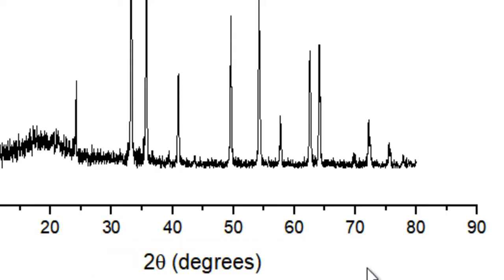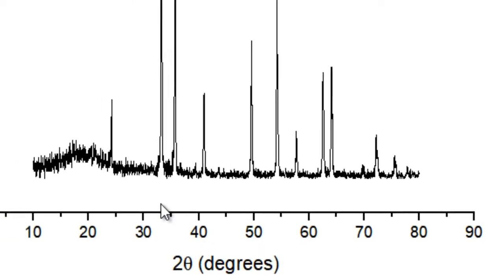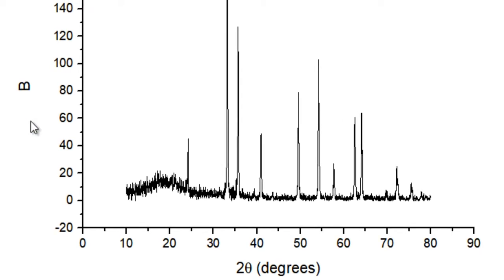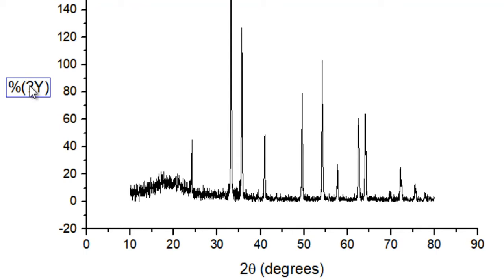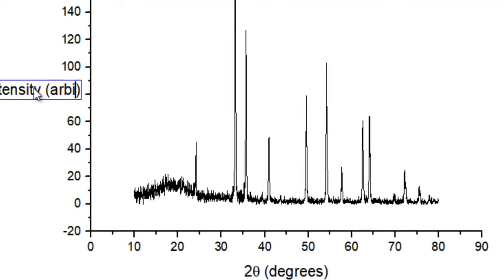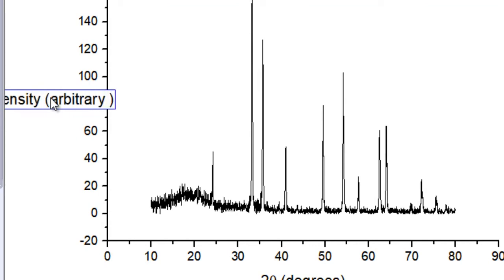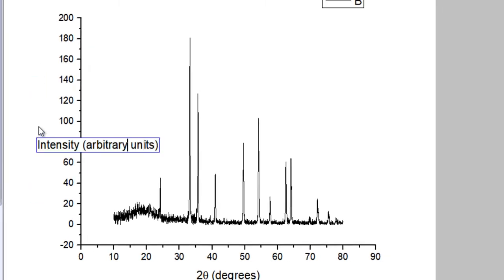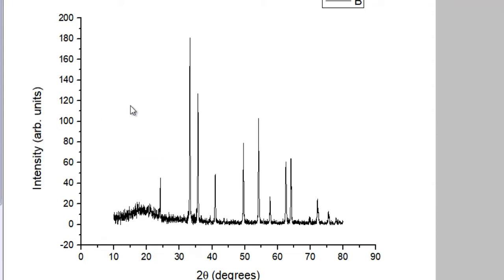Now the X axis is labeled. The next thing is to label the Y axis. Double-click on it, select all the existing text, and write 'Intensity.' In parentheses you can write the units — intensity has no particular units, it's just arbitrary units, so you can write that, or write 'ARB.' in shorter form.